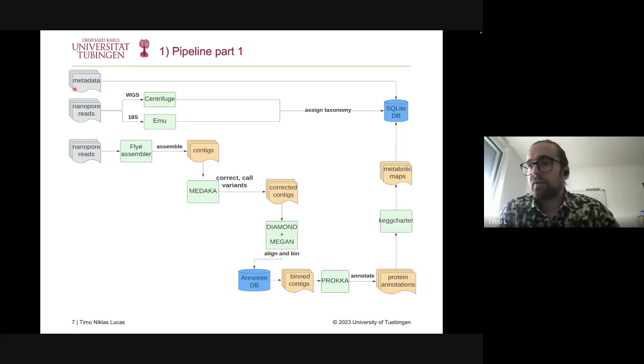What I haven't told you about is the metadata you can also put into Monitor. Metadata being, for example, production rate of caprylate. That's what I was interested in, and that's why we made this possible, or like pH value, temperature, oxygen value, whatever you can imagine.